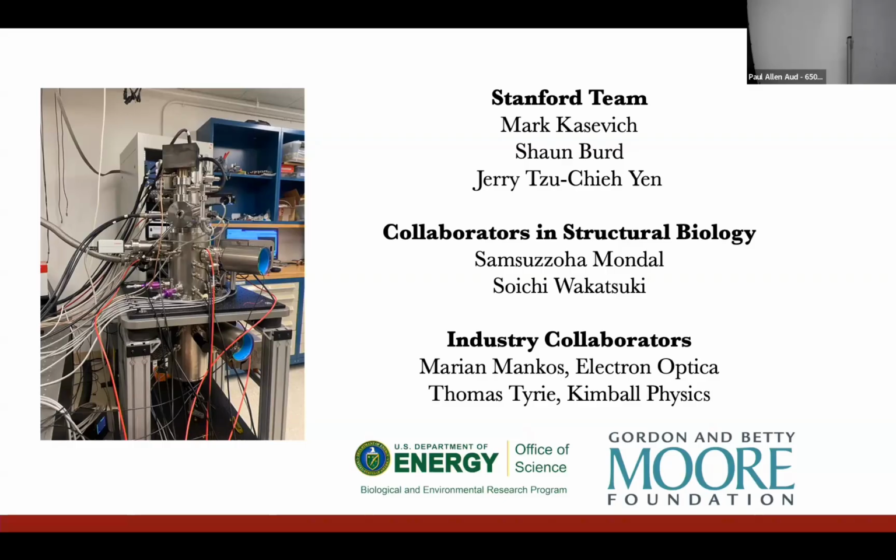Yeah, nice work. If I want to get the Raman spectrum with the cavity enhancement, what kind of scanning range is realistic to do? The range that we scan over is limited by the pulse bandwidth, and then by your signal to noise, basically. So we're looking at bandwidths of a few hundred wave numbers. We can collect those spectra in a second easily. It depends on the concentration, of course, but for the data I showed, you can easily do it in less than a second. It's just limited by the speed of your delay stage.